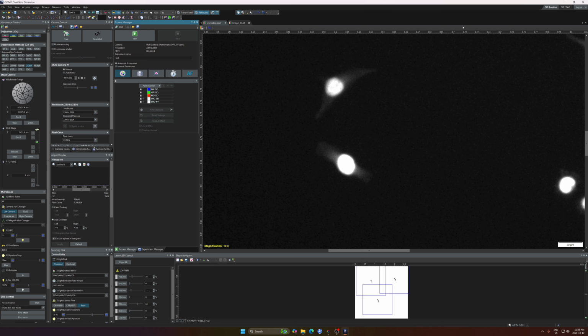By default, if you start this routine layout, you probably already have multiple channels listed. Click this expand, and this will show you what that setting is. So this DA means DAPI, spinning disk. You heard some noise. That means the spinning disk is sliding into the system. Of course, normally for anything below 40x, we would not recommend using spinning disk. But just for demo purposes, let's start with that.